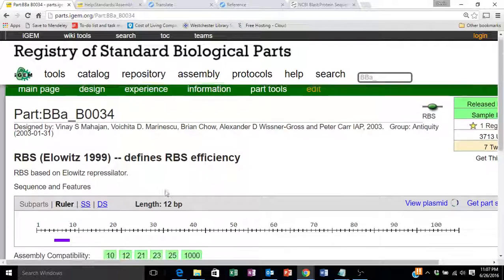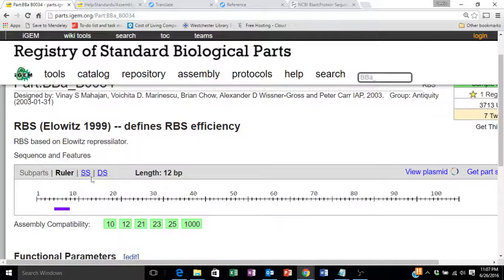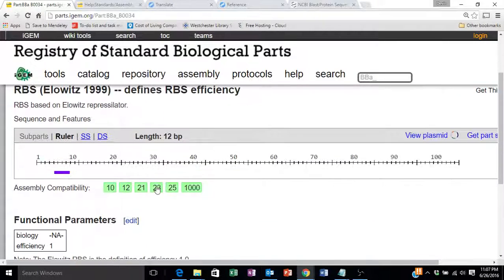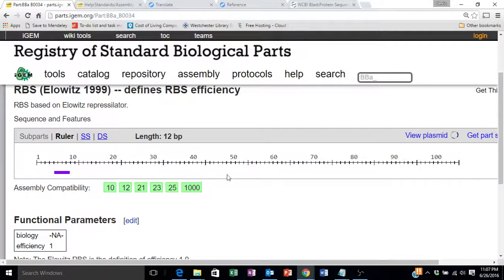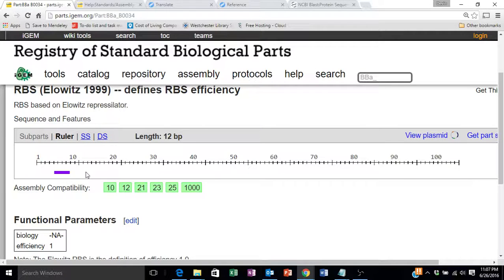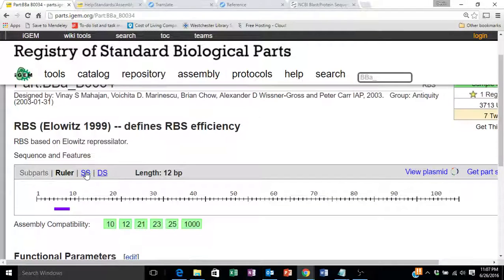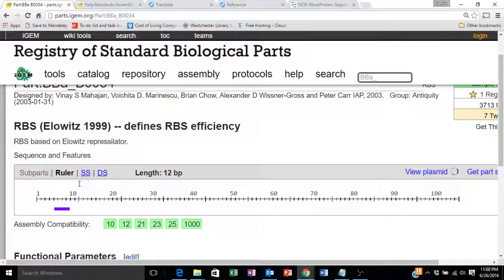The main page shows you a display indicating the different pieces or the different features in this part. This is a very simple part. This is simply a ribosome binding site.